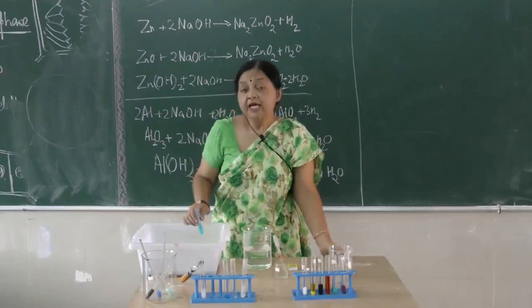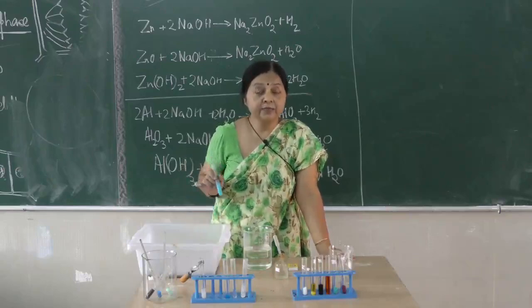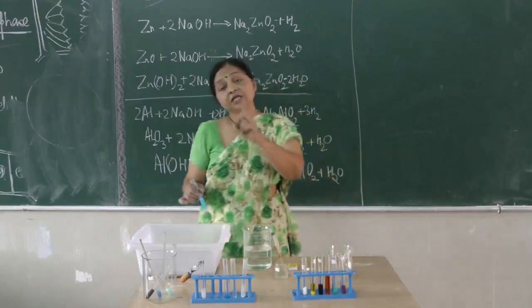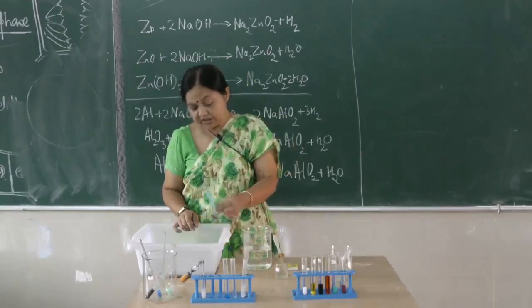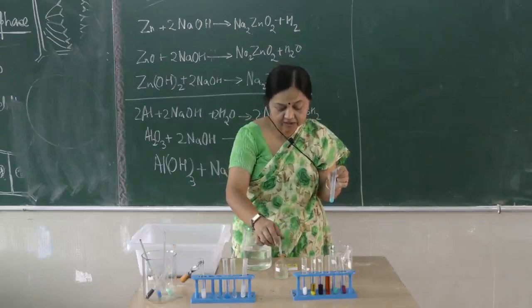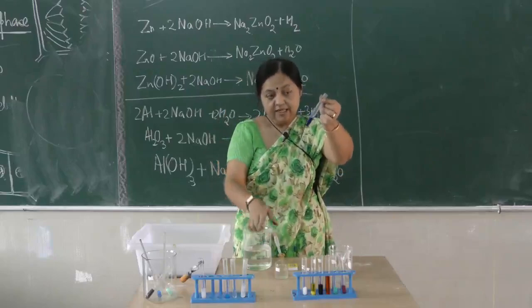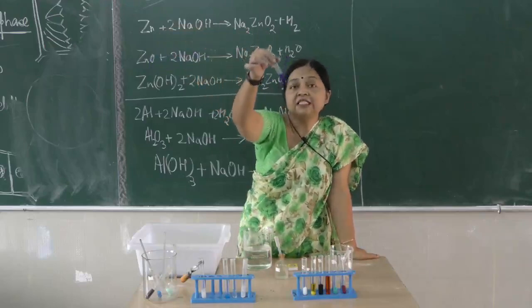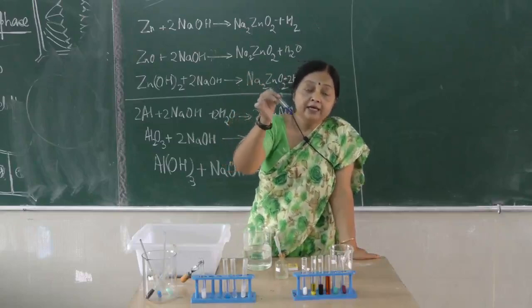In NaOH also it gave a pale blue precipitate, sorry, precipitate, not solution. So the pale blue precipitate of copper hydroxide, in NaOH also you got that, but that was insoluble in NaOH. Here we have taken ammonium hydroxide, and if you add excess of ammonium hydroxide to this pale blue precipitate, then see what happens. The precipitate dissolves, and you can see through this liquid, this is a transparent inky blue solution. So this is the test of copper ion. Inky blue solution is formed.